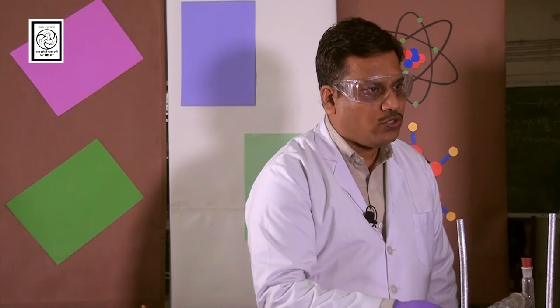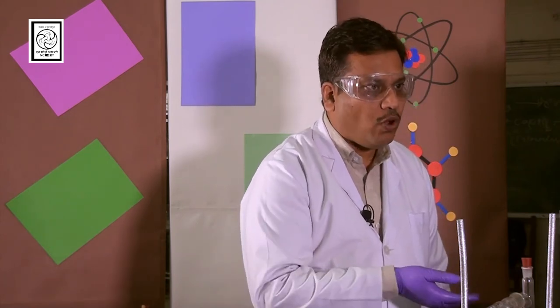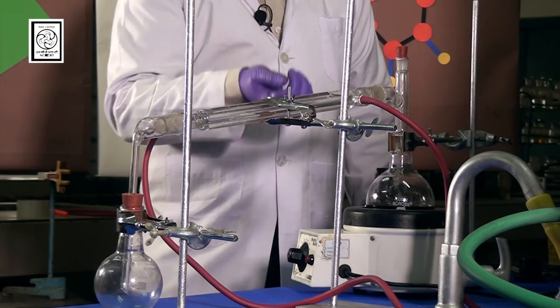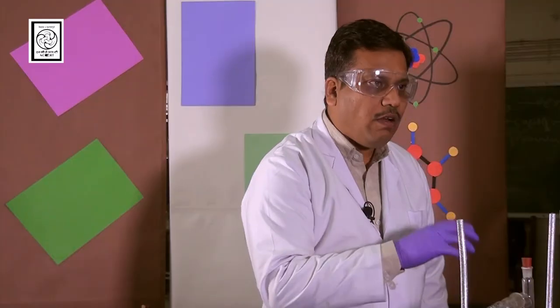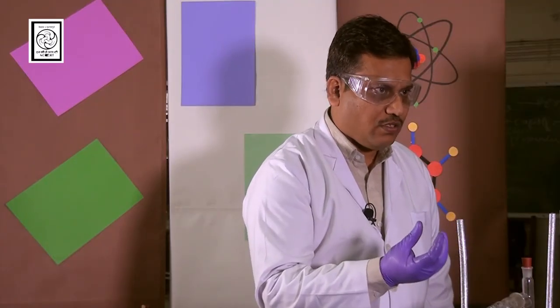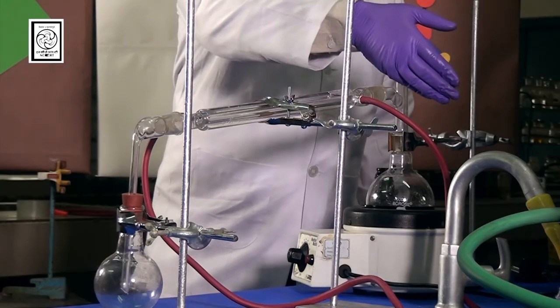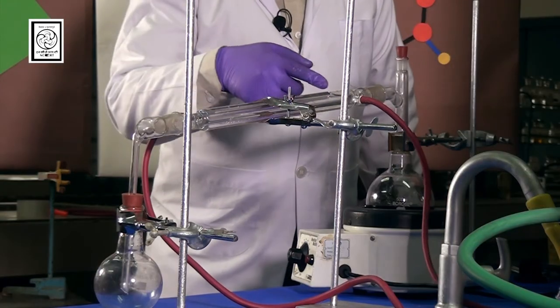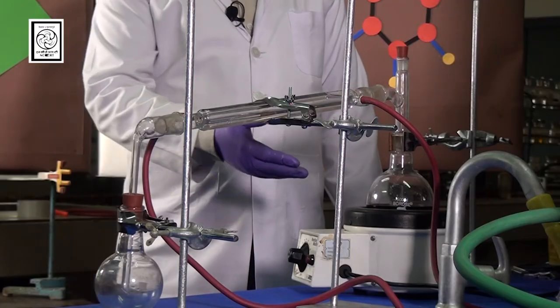So why are we using these porcelain chips? Because we are using organic solvents. If we will not use these porcelain chips then solvent may bump out. The liquid may bump out from the flask. They will provide a certain surface for boiling. That's why we are using it. Now you can see that water is flowing properly through condenser. So let us initiate the process of distillation.